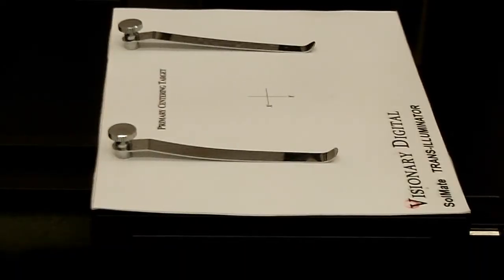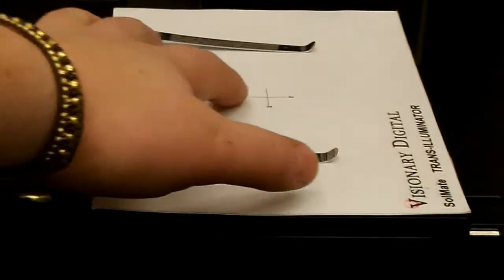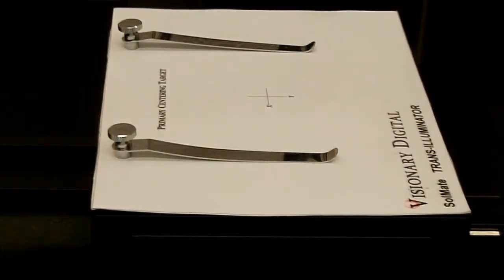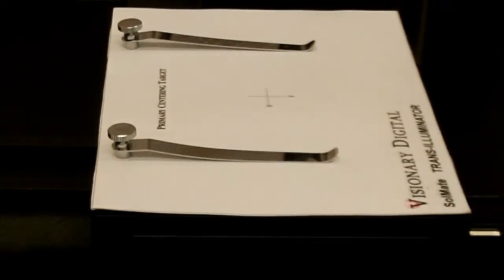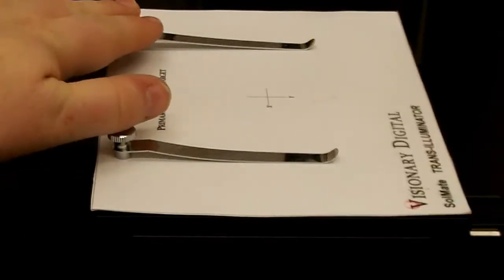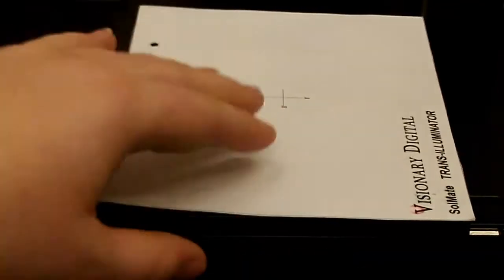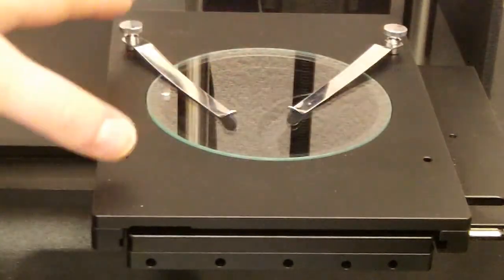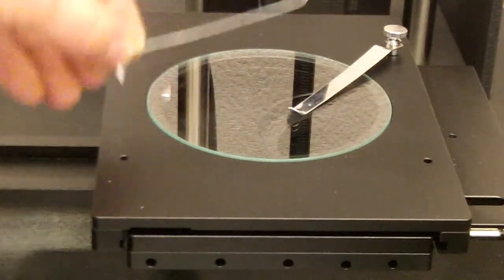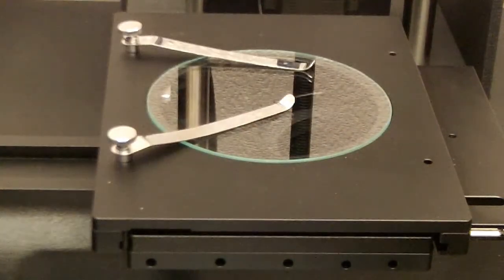And here is the stage for the SolMate. And on the stage is a centering target, which is good to have. It has an XY axis on the center, which is good to use before you put your actual slide on, so you can get the center of the stage in focus with the camera above. It's held together by two spring clips, which just pop out, and if you take the stage off, you can see there's a circular glass pane on the stage, like a microscope. And there are four different mounting holes that you can put the spring clips in, either here, here, or here, whatever turns out best to keep your slide secure.